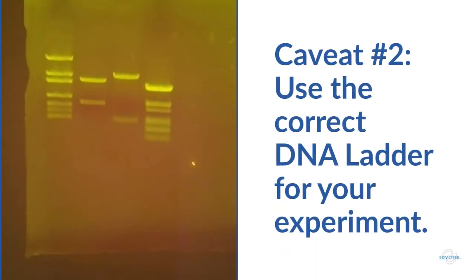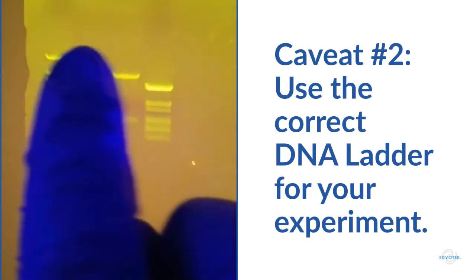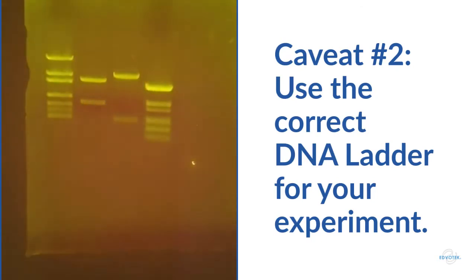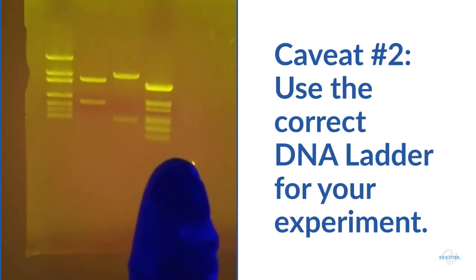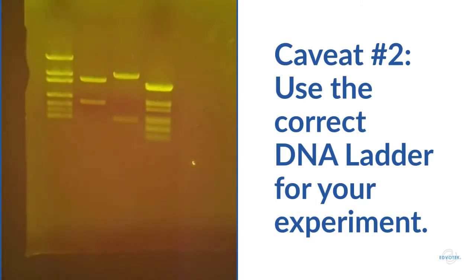Next, you have to choose the correct ladder for your analysis. Ideally, the bands in the ladder would flank those in your experimental sample, which would allow you to make a more accurate estimate. So, here's our gel again. As we can see, the topmost bands in our experimental samples are larger than the top bands of the Edvo-Quick ladder, which is in lane four. So, we can't use this ladder for this particular analysis.